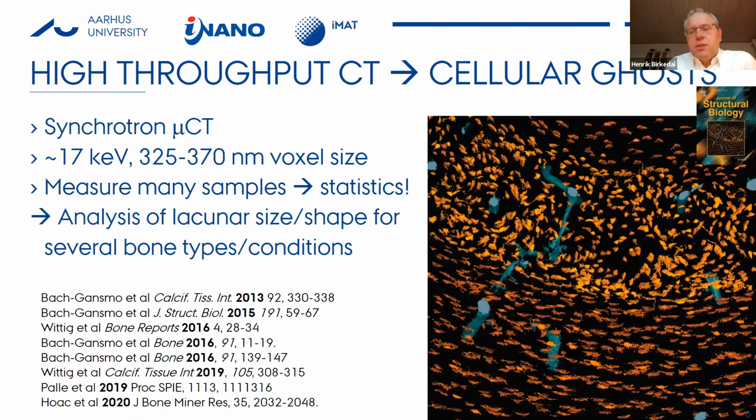So here's a simple example. This is from rodent bone. As you can see on the right, all the little orange guys, these are osteocyte lacunae, and rodents are quite different from men and women, as it turns out, and from humans. So the way the bone is formed is quite different. So you see here these light orange circles or blobs. These are osteocyte lacunae from what's called endochondrally derived bone, whereas the darker orange ones are formed by apposition.